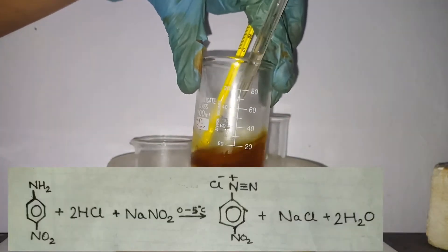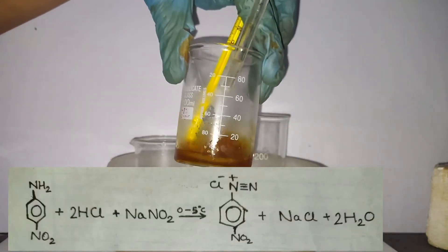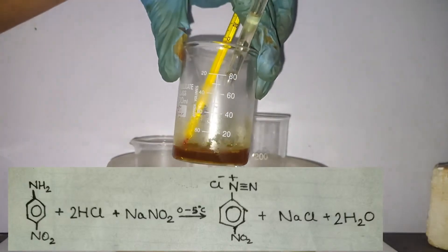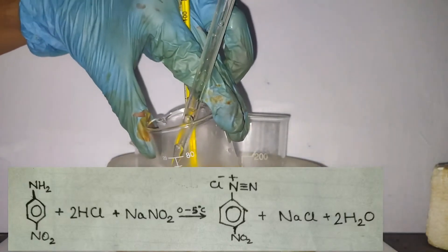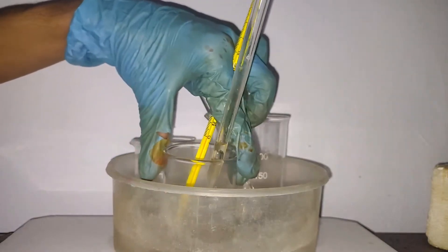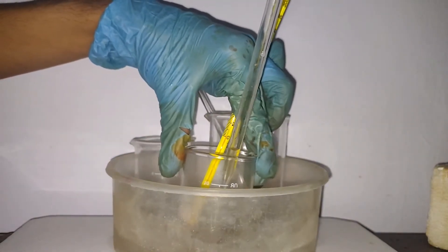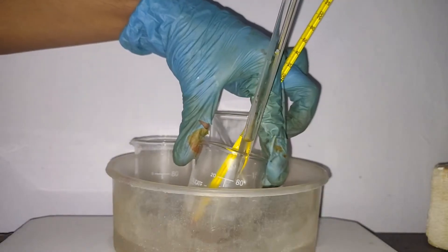What's happening here is para-nitroaniline is reacting with hydrochloric acid and sodium nitrite to form para-nitrobenzene diazonium chloride. This salt is only stable at cold temperatures.